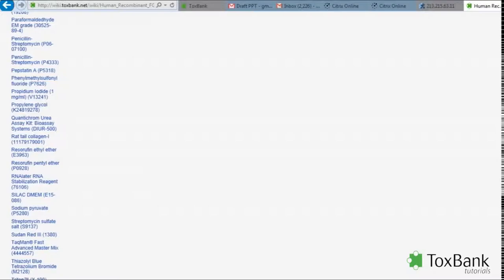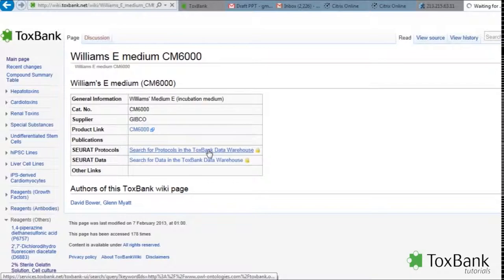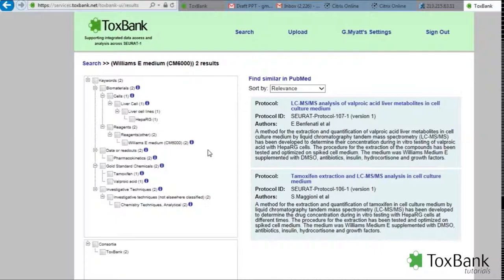So if we look at, for example, the reagent at the bottom, what we can also do is we can link to any protocols or data in the warehouse. So clicking on this link will direct you to the data warehouse for, in this case, any protocols. We have two protocols which have this information.